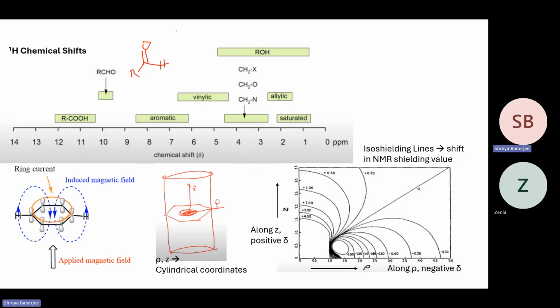So you can consider, we saw that with C double bonded C, if there was a hydrogen, this was already downfield shifted around here, 4.5 to say 6.5. Now there is an additional electron withdrawing effect of oxygen. So this will be even more downfield shifted around 10, that is the aldehyde.